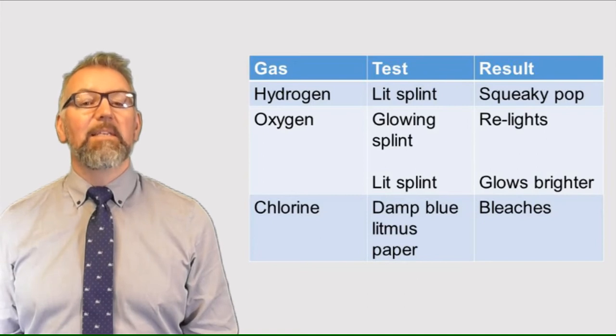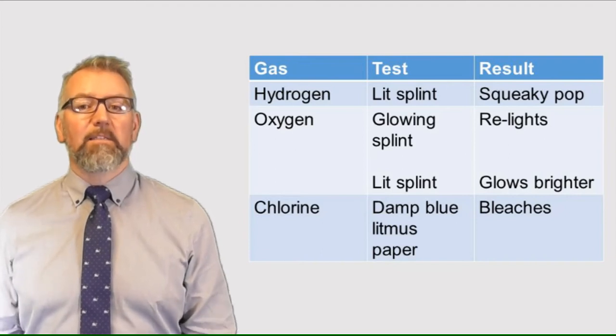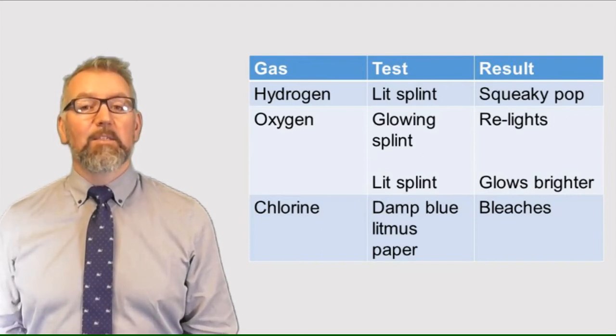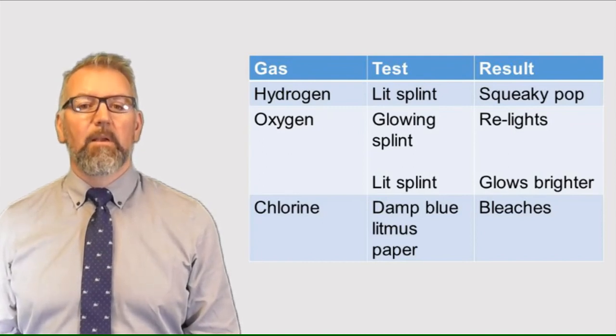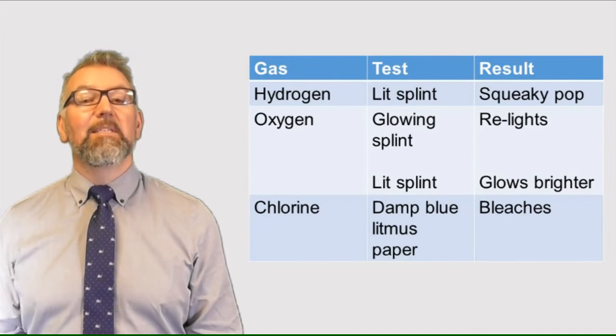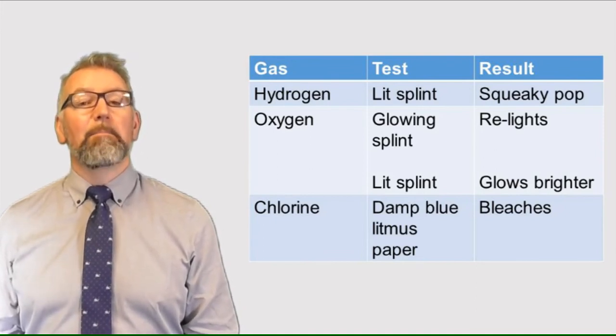Oxygen gas can be tested in 2 ways. The most common way is using a glowing splint. The result is it relights. Or we could use a lit splint and the flame will glow brighter. For chlorine gas, the test is damp blue litmus paper. The result is that it bleaches the litmus paper.